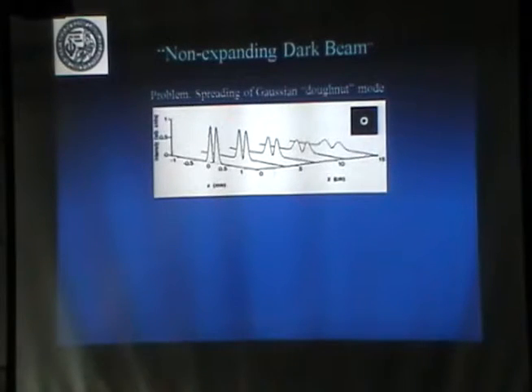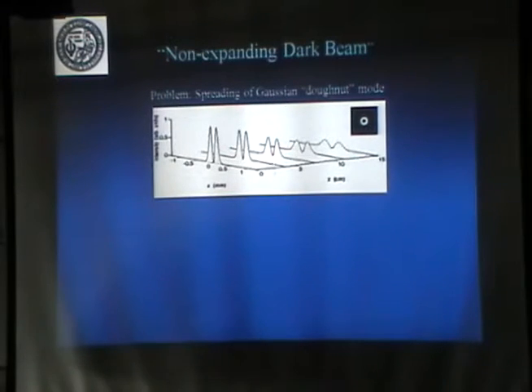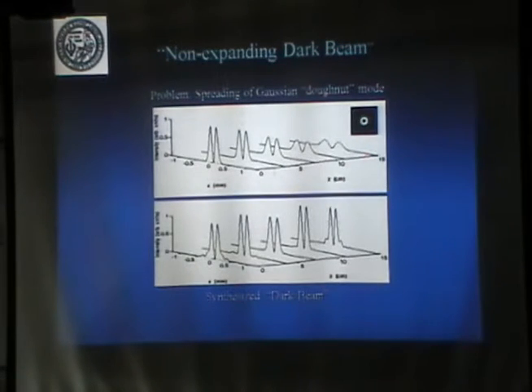One example, different from the one I showed you, is here. We have these donut modes that are useful, for example, for super resolution. As you go out of focus, the intensity goes down, and this angle here, the notch, is essentially expanding. So you would like to have something more constant as this beam propagates. If you do this optimization, you can get something like this. Now this happens only in a certain region of space. It looks better than this one because it's more constant.